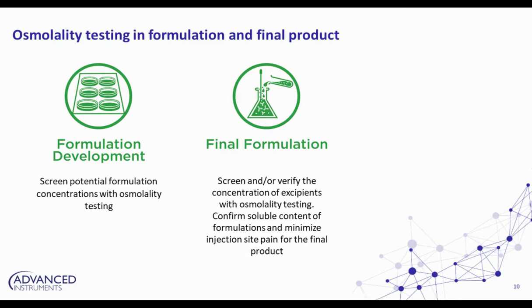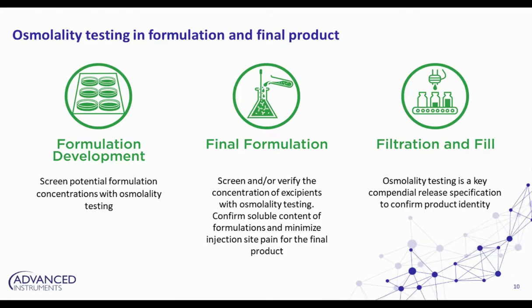Additionally, osmolality has been associated with the injection site pain experience with some of the final formulations and final products of mAbs. And lastly, osmolality is actually a compendial test, so it's something that we pretty much see 100% use for that last identity measurement and specification. So, of course, this is an area where we see a lot of value for this test. So that's just a little bit of an overview of each of these areas.